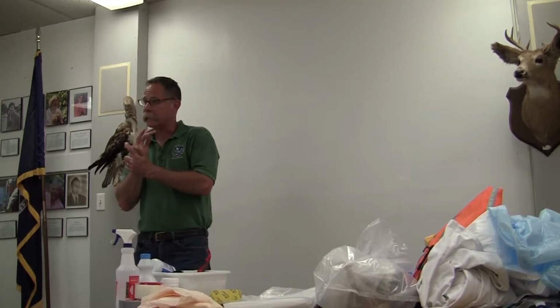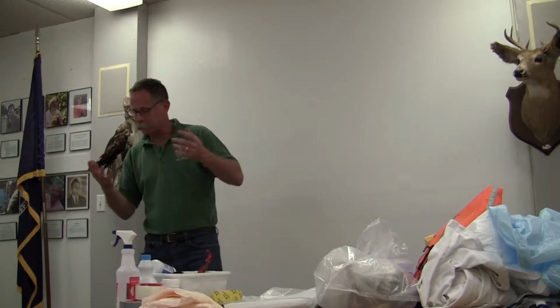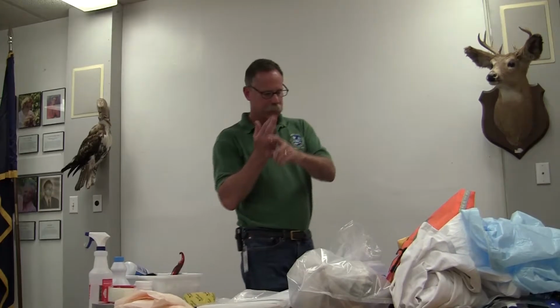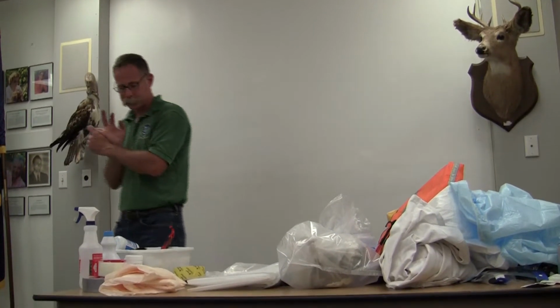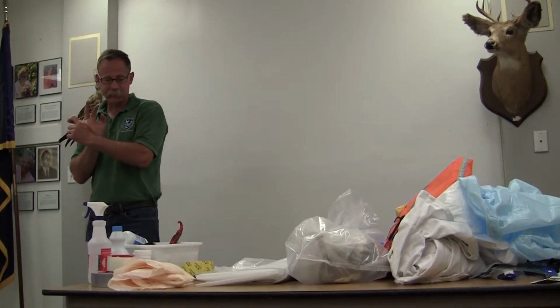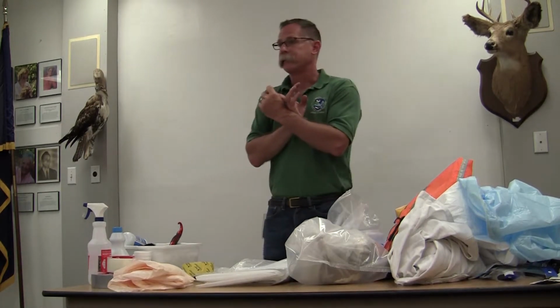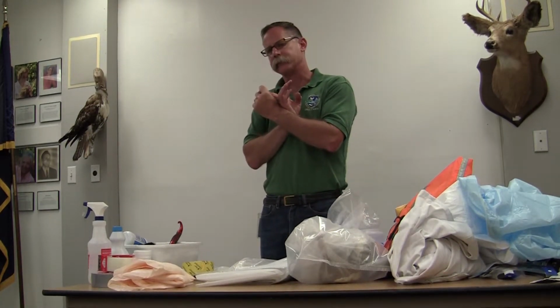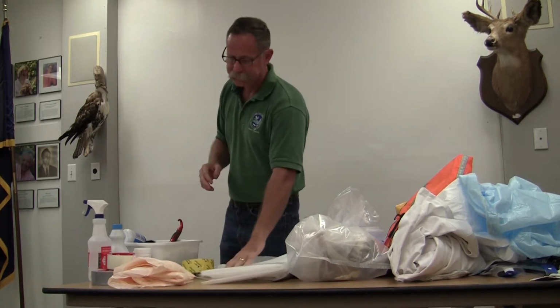We can use straight bleach from the bottle. It's a 1-hour contact time. It's not really good for your respiratory system to be using that. It's kind of corrosive. Sodium hydroxide, 2-normal, which we use in the lab sometimes, is a very slippery base. Same thing, 1-hour contact time. Or you can burn it for 1 hour at 1800 degrees. And we've had some problems trying to disinfect the trucks with that method. In the end, the fleet guys are pretty upset.